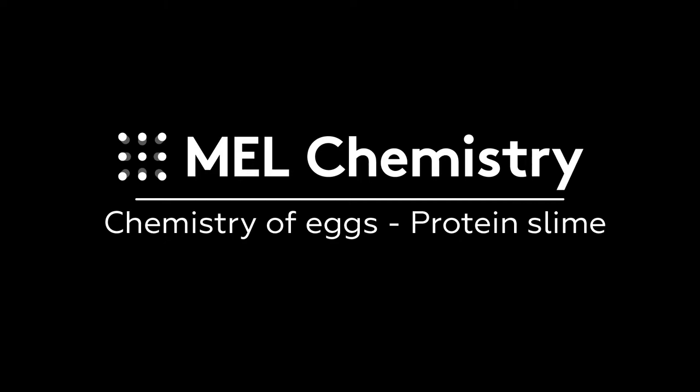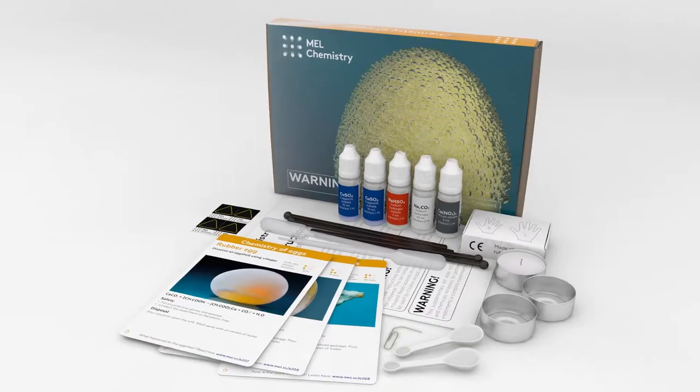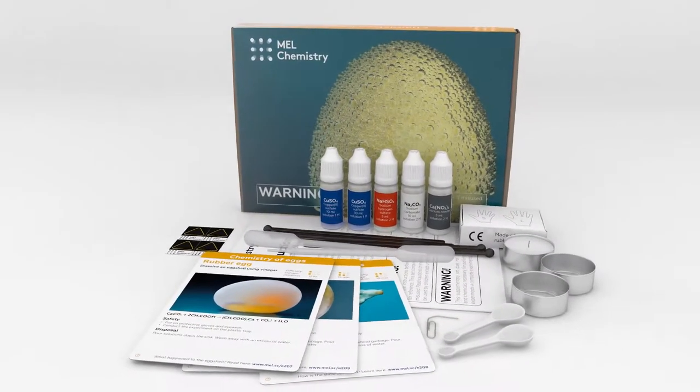Welcome to the wonderful world of chemistry. Today, with the help of the Chemistry of Eggs set by MEL Chemistry, you will make slime out of an egg white.